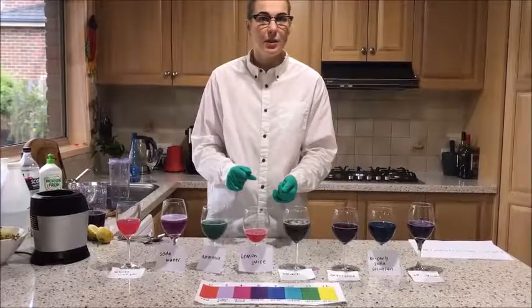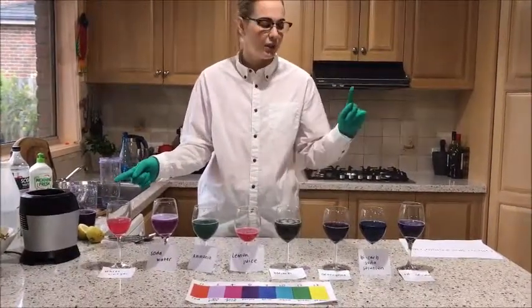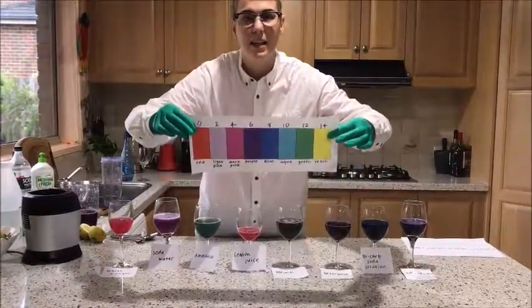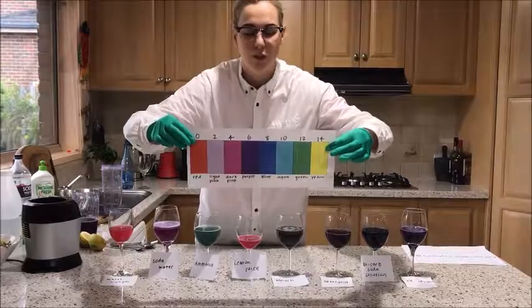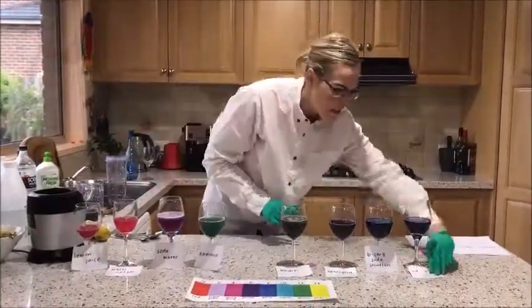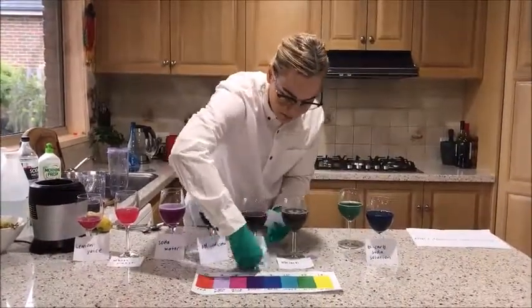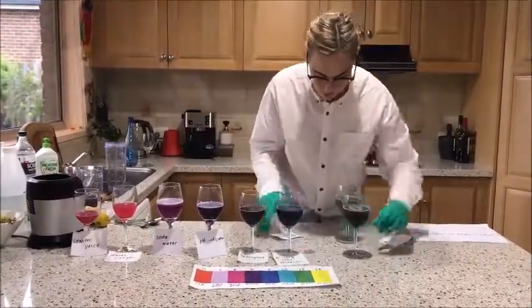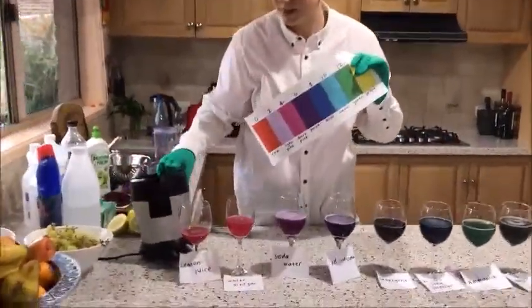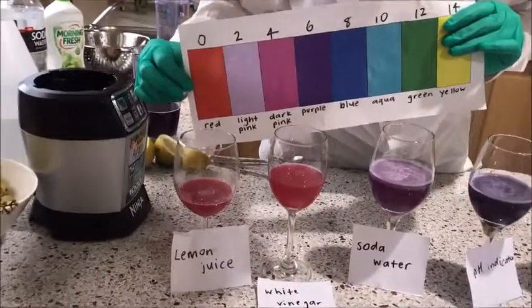So now I'm going to put them in order of strongest acid down this end to strongest base down this end using the pH indicator chart for red cabbage. See that the lemon juice is red.